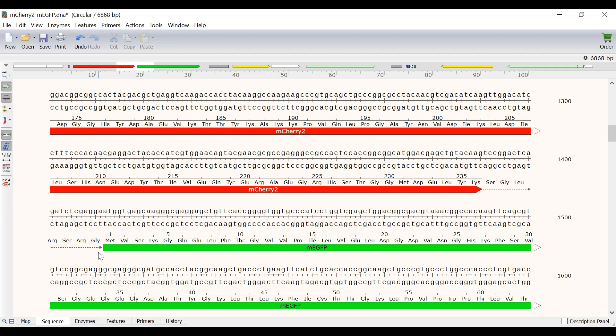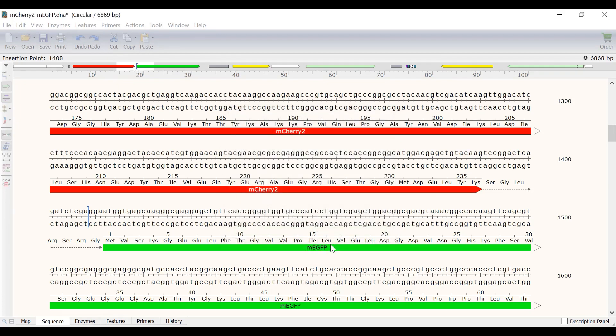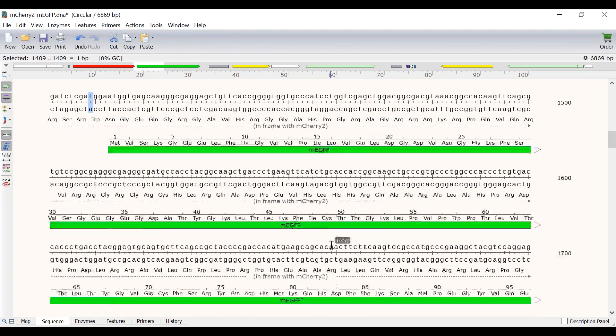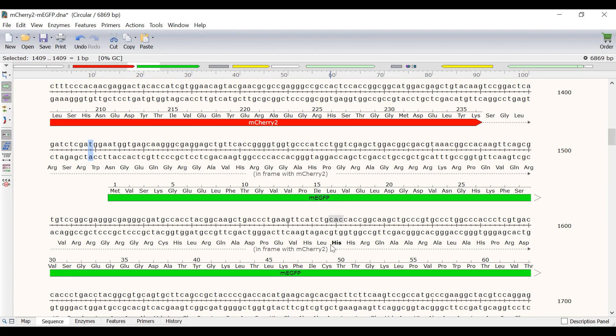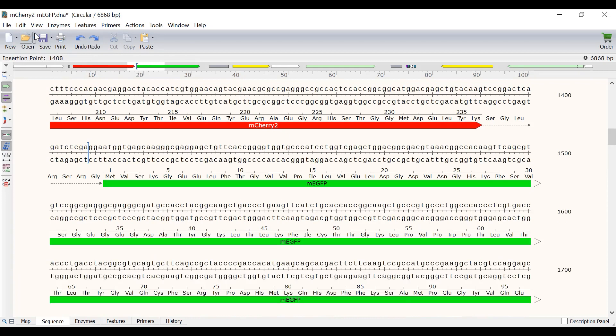To see what it would look like if these two features were not in frame, I will simply add a base just before the monomeric EGFP feature. Now the mCherry2 feature runs on past the monomeric EGFP feature as indicated by the dotted line. I will go to edit, undo insert bases to revert back to the original sequence.